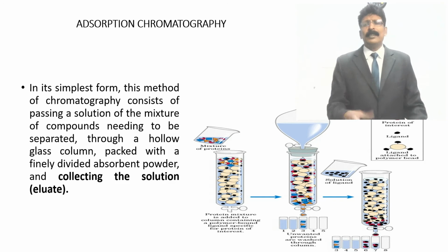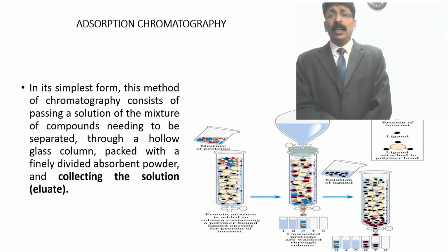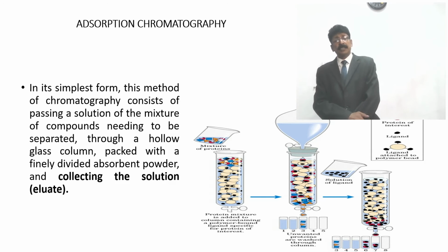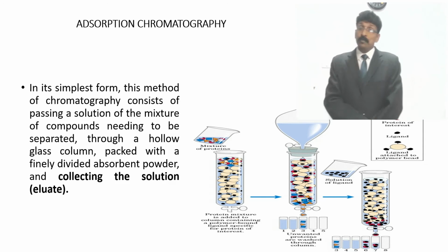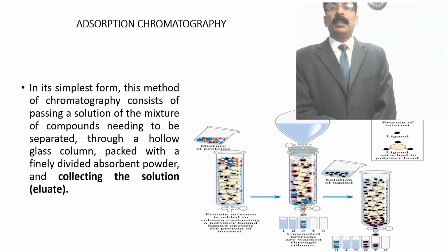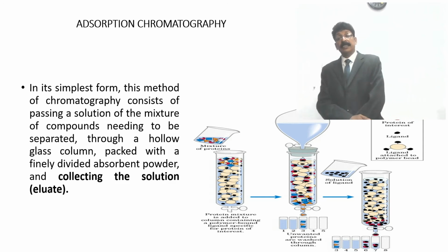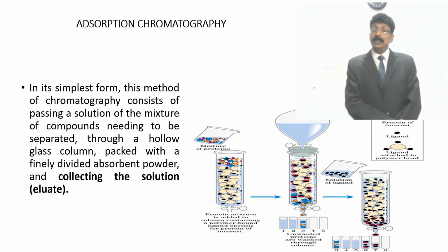This is the technique of adsorption, very easily. The affinity of the molecules present in the mixture of compounds towards the stationary phase: if it is more, they will stay for a longer time, and if they have no attachment with the ligand or with the stationary phase you are using, they will be eluted initially.